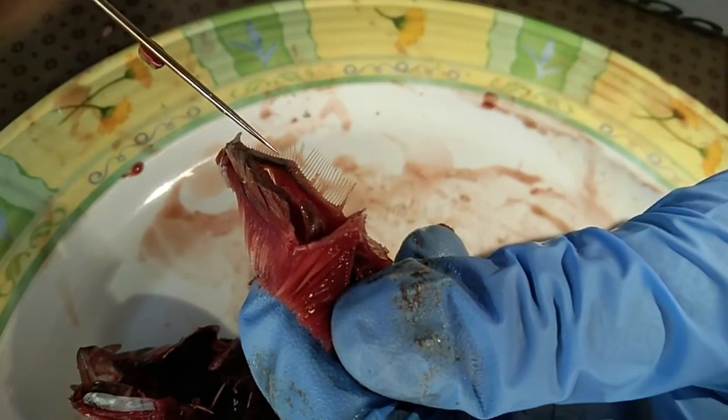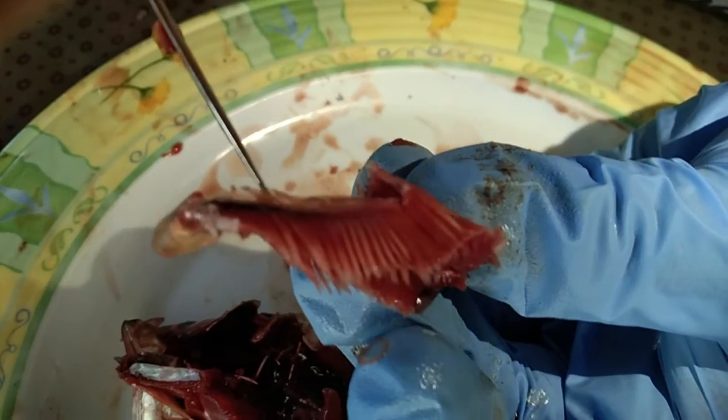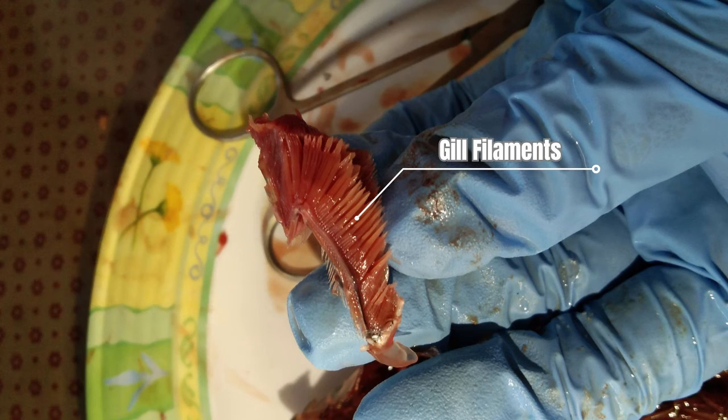Lastly, let us identify the gill parts. Here are the gill rakers attached to the gill arc, where the gill filaments are also attached on the other side. The gill arches are considered part of the skeleton and hold the gills in place. Each arch supports one or two rows of gill filaments. The gill rakers are an anatomical feature that aid in the gathering of food and protection of the gills. The rakers are located inside the oral cavity and point anteriorly from their attachment to the gill arch.